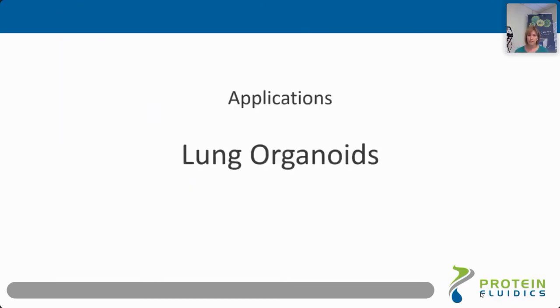Now, in the next part of the talk, I would like to talk about few specific applications using various organoid models that we've been using with a Puma system. And we will start with lung organoids.